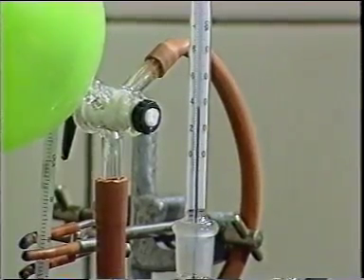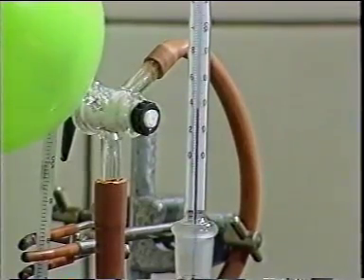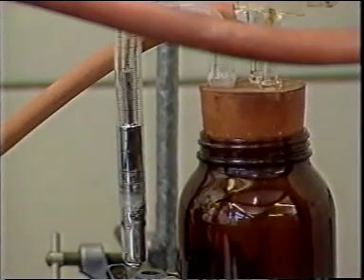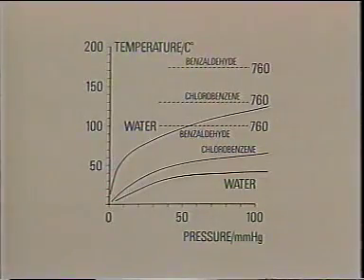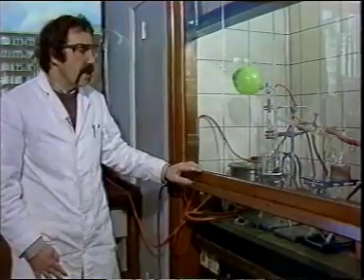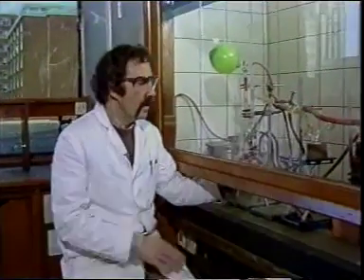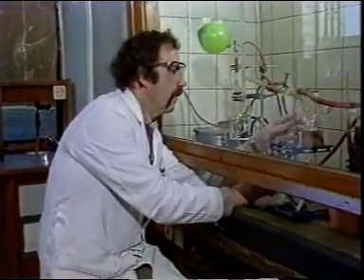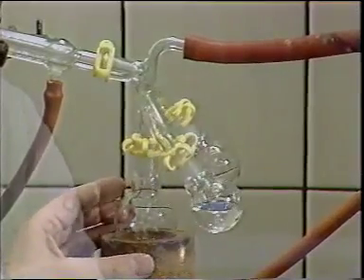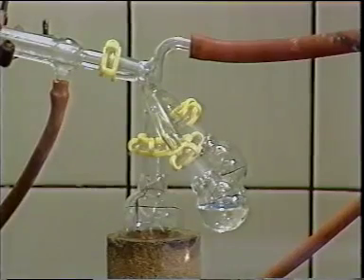We can see that the temperature of distillation is about 40 degrees, and at the other end of the apparatus, our water pump is giving us about 30 millimetres of pressure. If we look on the graph we saw previously, we see that this fits the expected temperature and pressure for the boiling point of chlorobenzene, which is in fact what we have in the flask here. Now that we've reached our expected temperature and taken off our pre-run, we can adjust the pig and begin to collect our main fraction through the second outlet.